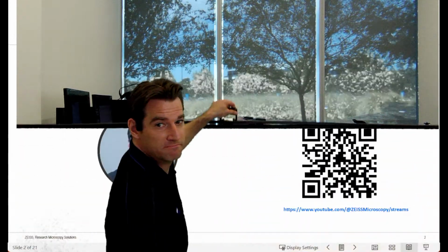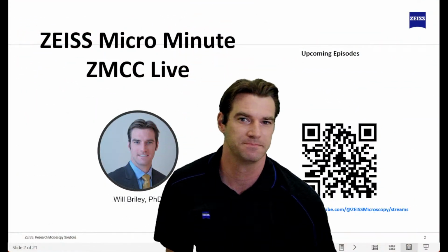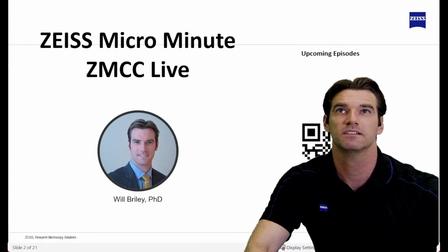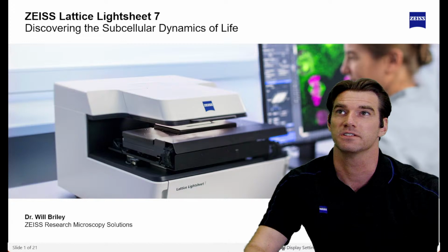So I've got some information here that we can go over. Let's take a look at some information here. There we go. That's better. Okay, so looking at the lattice light sheet technology, let me turn this on. There we go.